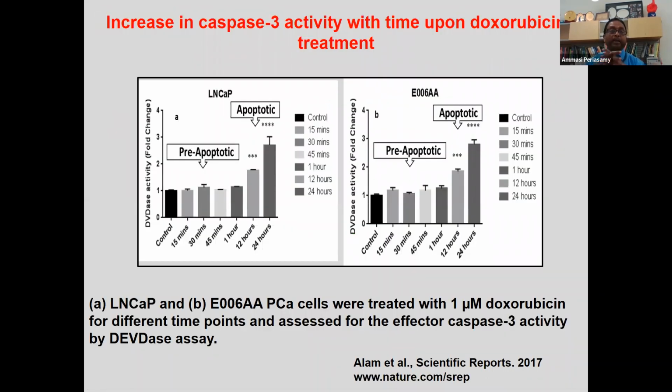So many questions came when we submitted the paper, that with doxorubicin, if you keep it for a long time, apoptosis takes place. It may kill the cells. So we thought that we should use that approach to demonstrate that what we are seeing, the decrease in lifetime of tryptophan, is mainly due to the residues the coenzyme carries, which quench the lifetime. So we did the apoptosis work. You can see that after 12 hours, apoptosis occurs with doxorubicin, at 12 hours and 24 hours.